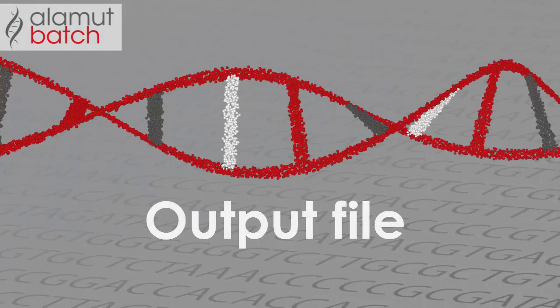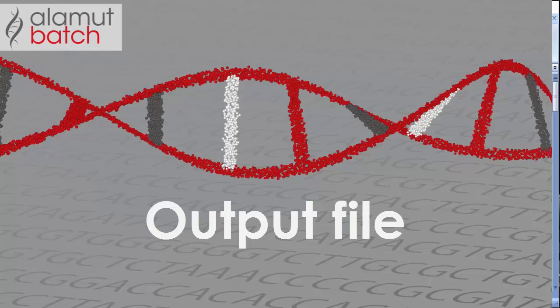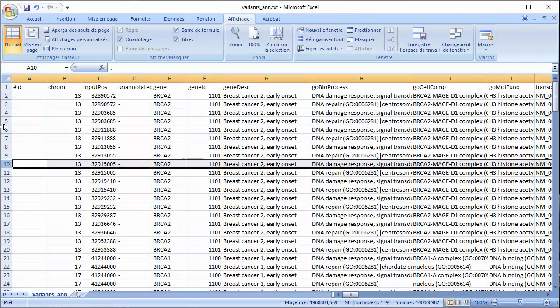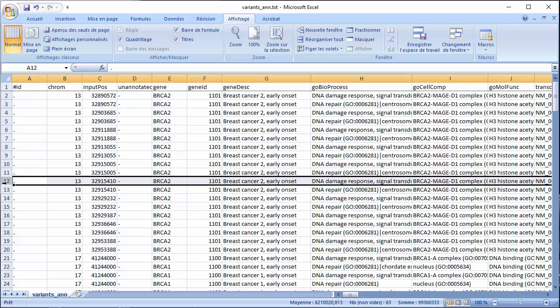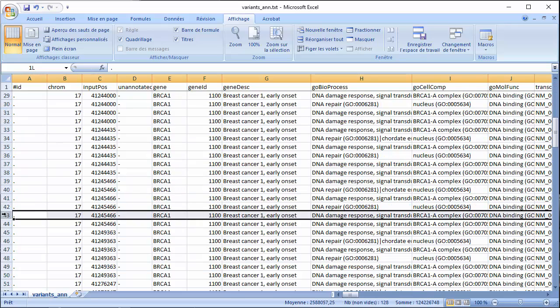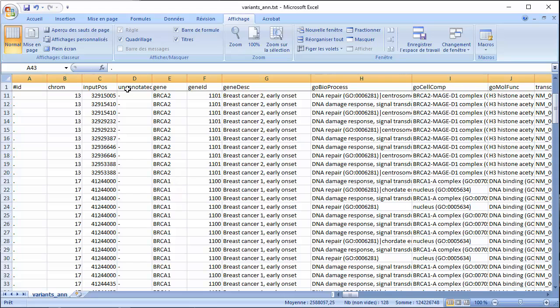Let's now take a closer look at the output annotation file, which is identical in both versions. It's a tab-delimited file with variants in rows and annotations in columns.